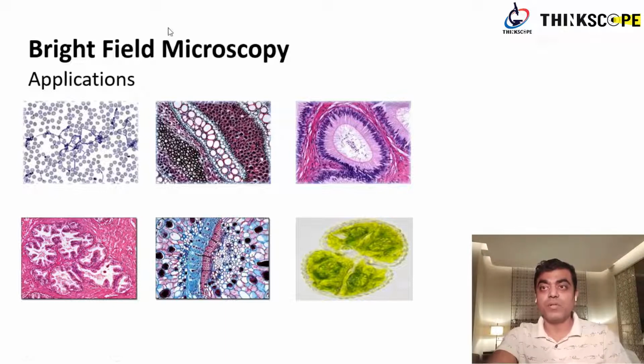In addition, you also have plant samples. So you have root, you have leaf samples, you cut them into finer sections, you stain them, and then you see it. You can see a lot of colorful xylem, phloem, vesicles, cell wall, cell structures, everything is quite easy to see. Now for histopathology samples, again, this is a part of pathology.